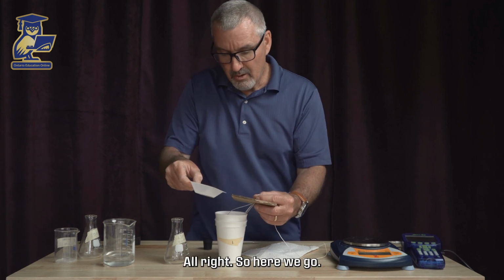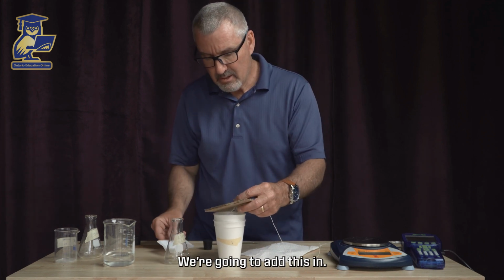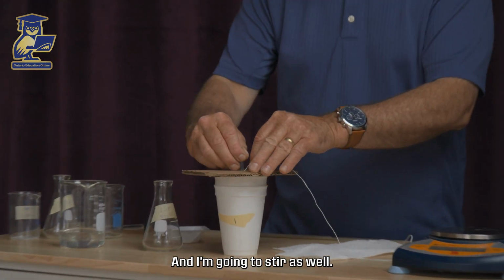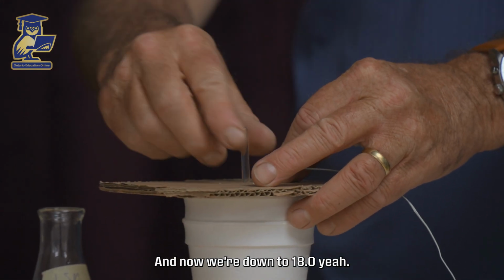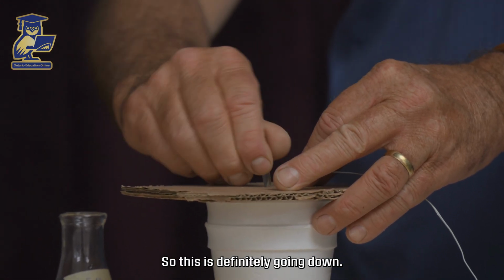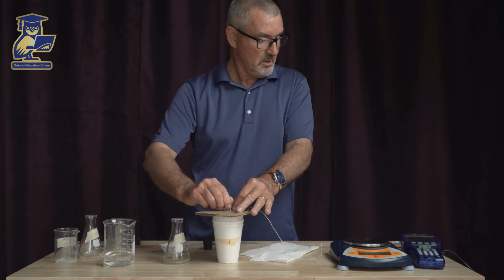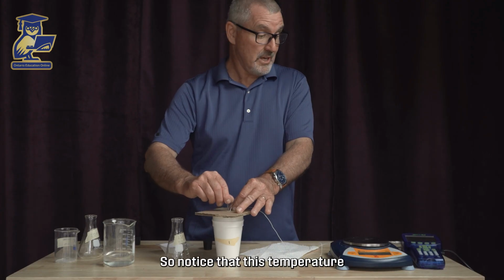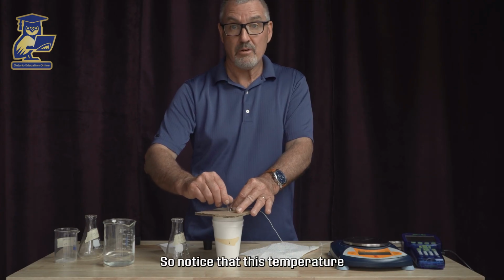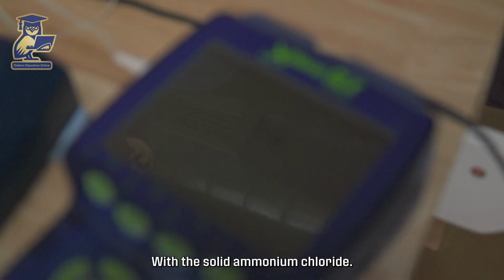All right, so here we go. We're going to add this in, and I'm going to stir as well. All right, and now we're down to 18.0. Yeah, so this is definitely going down. So I'm going to stir this, down to 17, down to 16. So notice that this temperature is decreasing with the solid ammonium chloride.